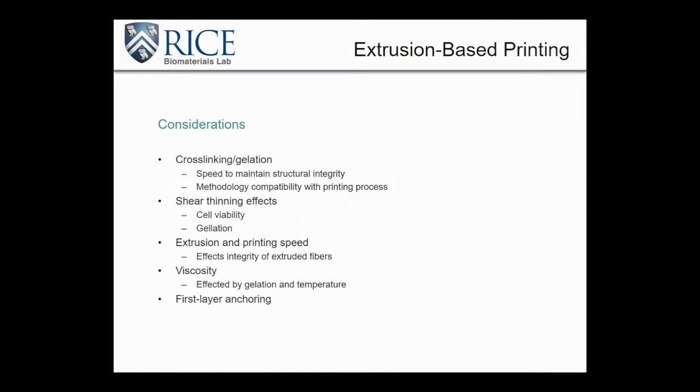Another thing that I'll talk about in the next slide here is the shear thinning effects that these materials have. Often, since we're working with higher viscosity materials, we'll be working with materials that impart shear stresses on cells as they are printed out that extrusion nozzle. So that drastically affects the cell viability, as well as the gelation of the material when it's printed. We're going to go into just a brief intro into that in the next few slides, but later presentation will dig much further into how shear thinning can affect our cells, as well as how we can affect shear thinning to improve our printing process.